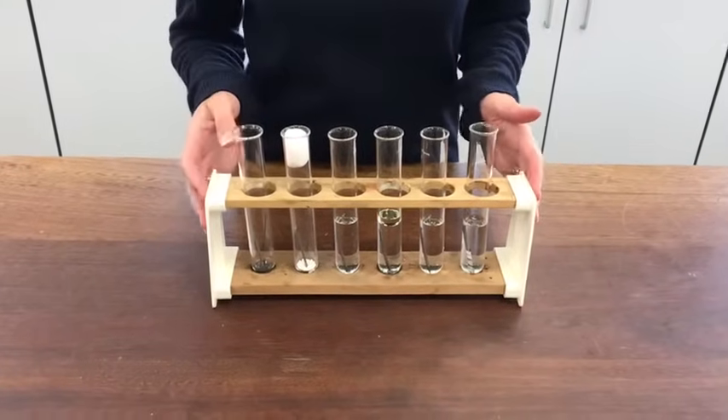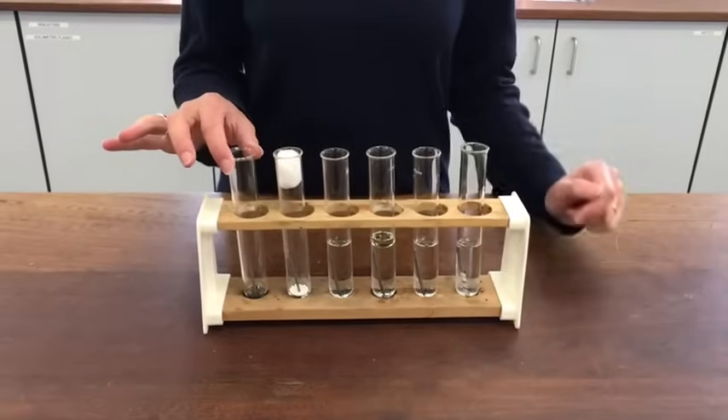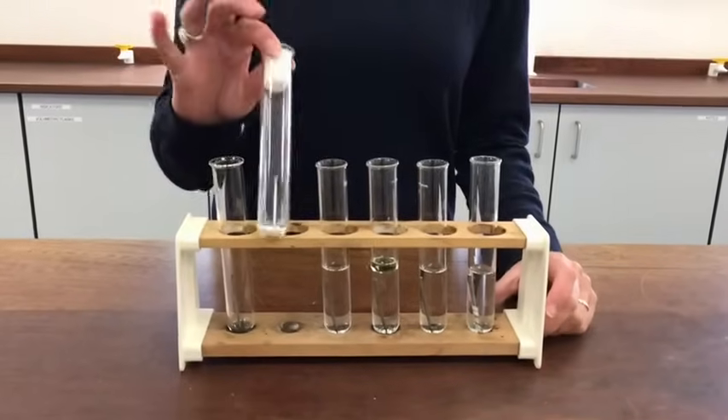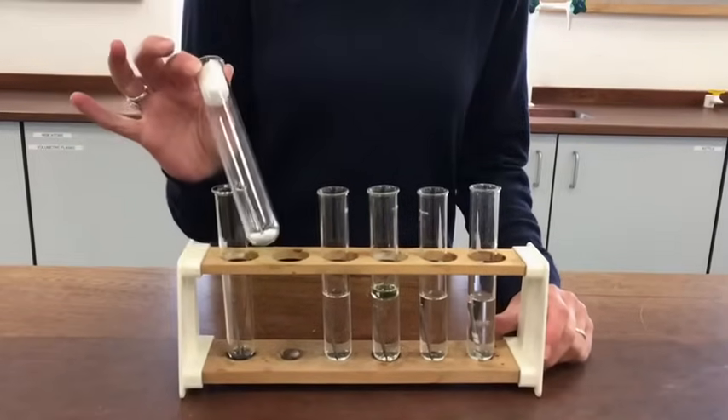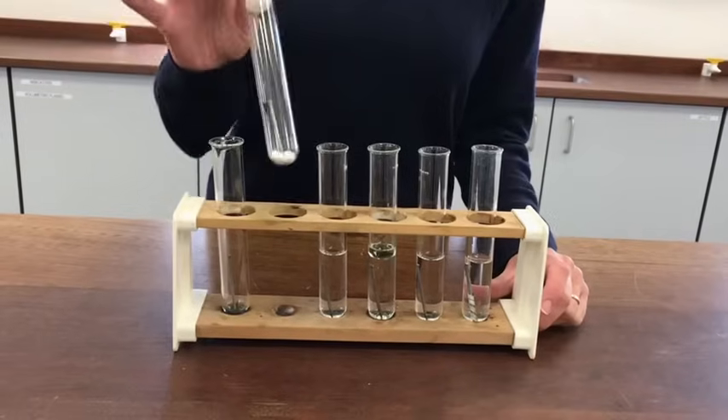This is the experiment that's been set up exactly the same as on your worksheet. So this one is tube A, which just has the nail in it. This is tube B, which has a nail and some calcium chloride in there. Calcium chloride is a drying agent, so it should absorb any moisture out of the atmosphere that's in there around the nail.